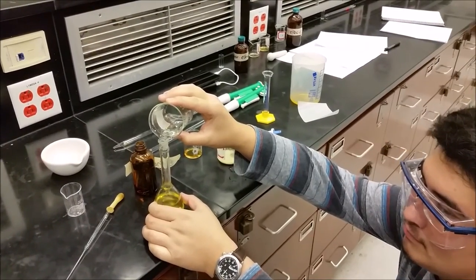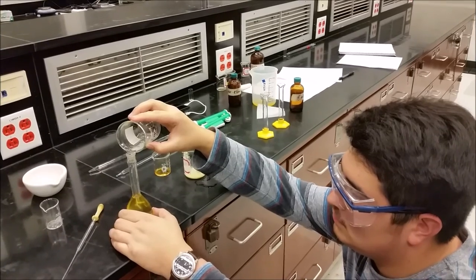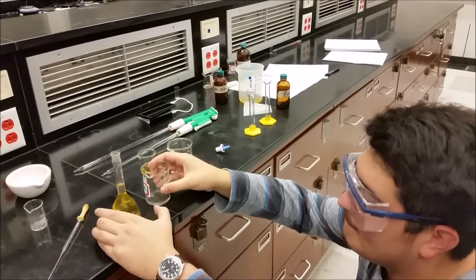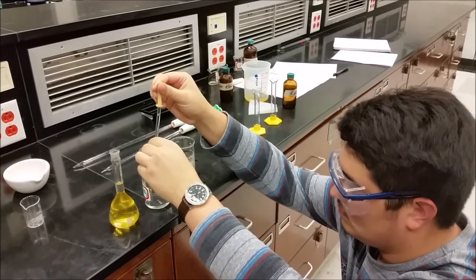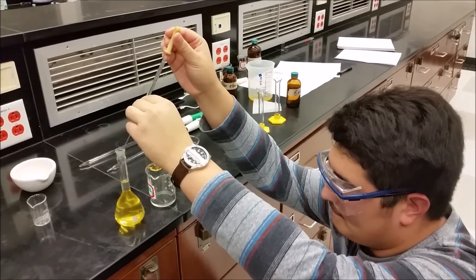Here, I'll explain some helpful tips for using a volumetric flask. This is one of the most precise instruments for measuring volume, and you want to respect that. Once close to filling to the 100 milliliter line, use a disposable dropper to place as precise an amount as possible into the flask. The closer you are to the 100 milliliter fill line, the more accurate your calculations.